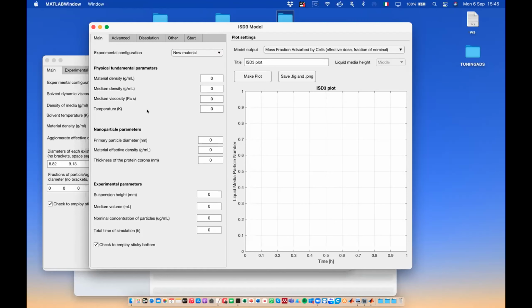So going back to my statement, can they be used for carbon nanotubes? The answer is no, because these two models really work well for particles that are almost spherical, or anyway have a shape that is almost round. They might be cubical, they might be rhomboids, but they cannot be long and thin or stringy. They have to be fairly rounded, even though the edges may be a little bit ragged. So that's an important distinction to make there. It's useful for nanoparticles with a nearly spherical shape.